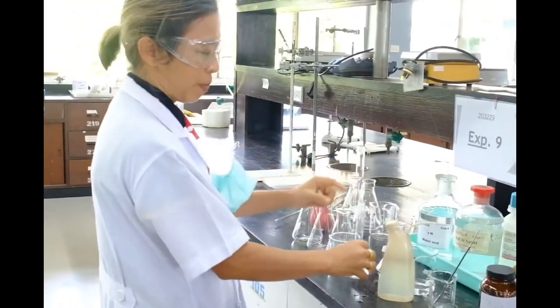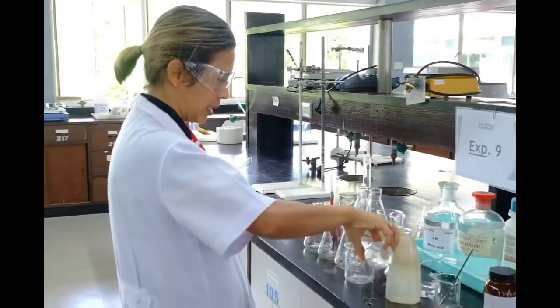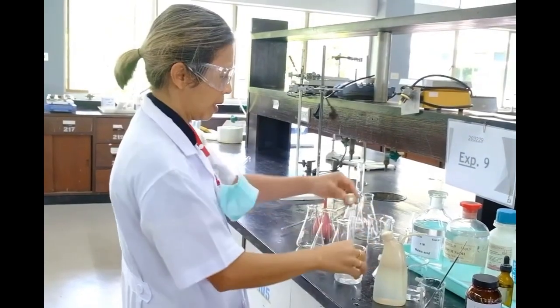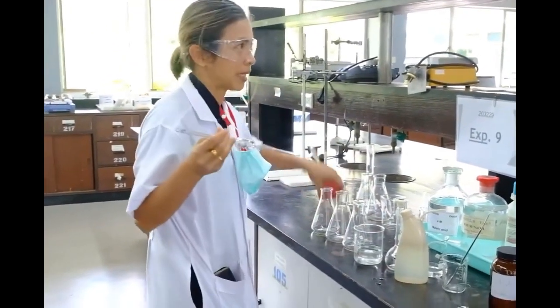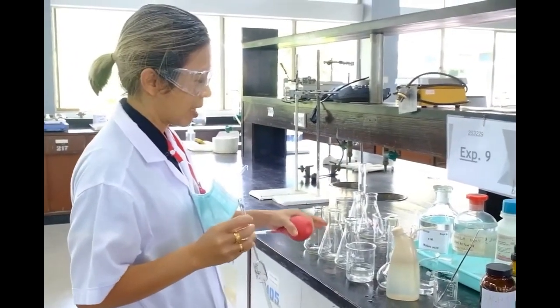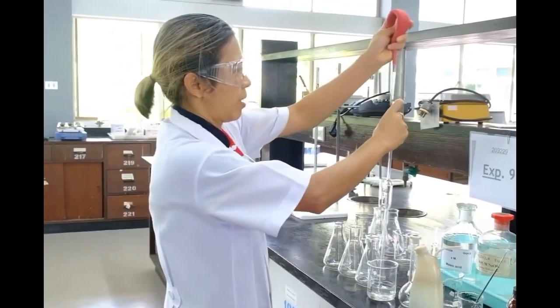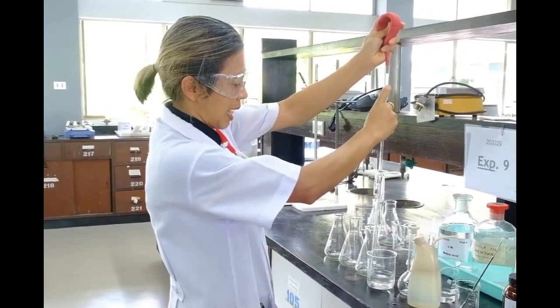The mouth of the volumetric flask is quite small, so we'll pour it into a beaker instead. For this experiment, we'll be titrating 3 times, so we'll pipette the solution 3 times into an Erlenmeyer flask. When pipetting, keep the tip of the pipette at the bottom of the container.